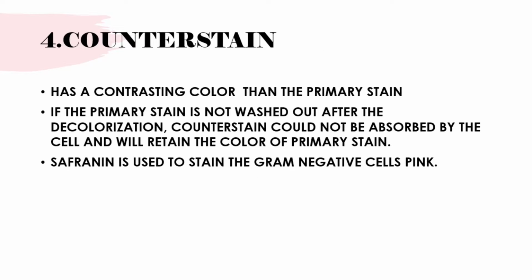The last reagent used is the counterstain. It has a contrasting color to the primary stain. If the primary stain is not washed out after the decolorization, the counterstain could not be absorbed by the cell and will retain the color of the primary stain. Safranin is used to stain the gram-negative cells pink.